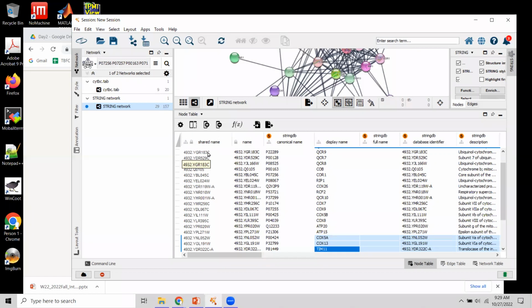In the case of other organisms, whatever is used as the second term might vary. So this is not consistent. You will find a UniProt identifier in one of the columns, but this might throw away some of the apps that expect the UniProt ID to be sitting here or in a name, not in an arbitrary column. So this might throw some of the applications away.